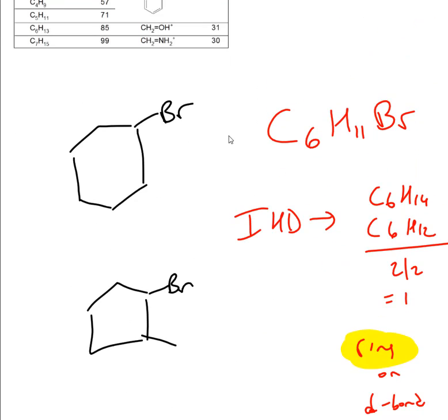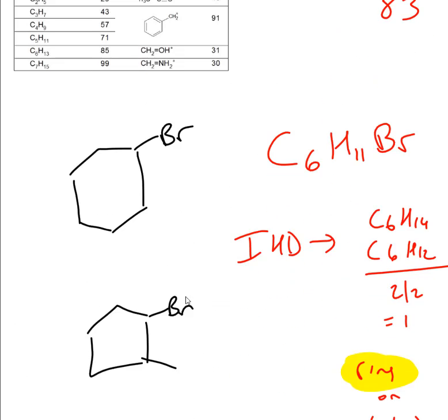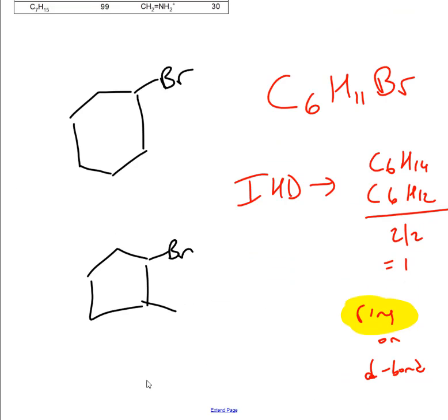So that means that it must be like this, because the only thing you can make leave is the Br, right? And then you have the first major piece, which would be a 6-membered ring. But if I have branching, then this can leave. Like a methyl could break off, or if I have even more, let's say we have a 4-membered ring and an ethyl, then the ethyl could break off, right? So that's why it makes sense that it's a 6-membered ring and the Br.